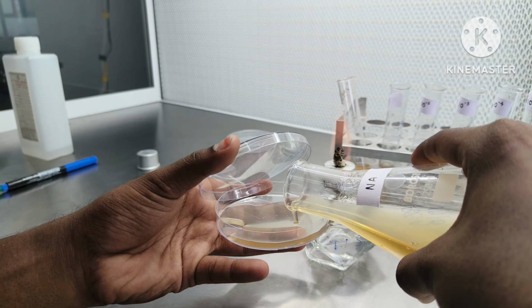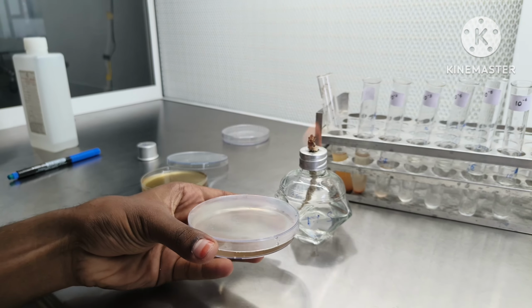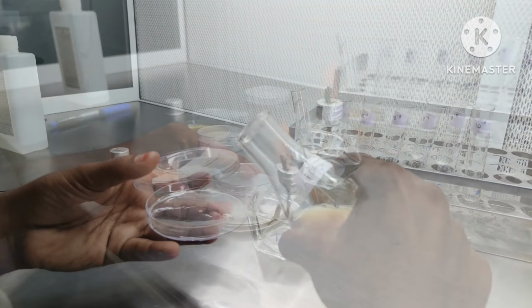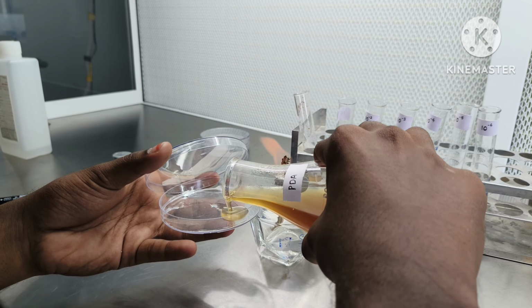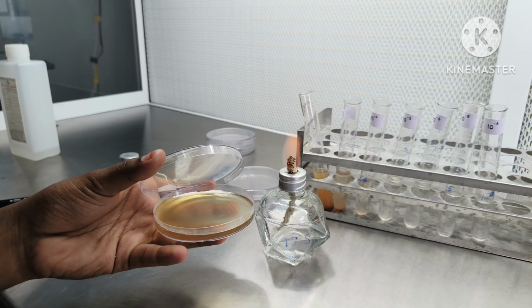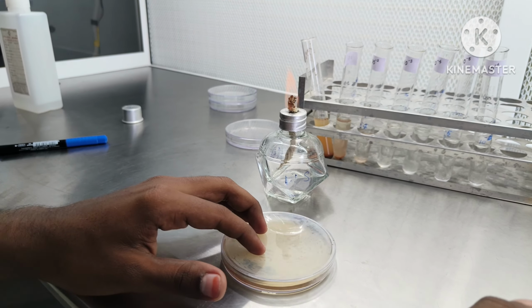15 ml of molten and cooled nutrient agar medium was poured to a disposable sterile Petri plate. The plates were then rotated in clockwise and anti-clockwise direction for the uniform distribution of media. 15 ml of molten and cooled potato dextrose agar medium was poured to a disposable sterile Petri plate. The plates were then rotated in the same manner done earlier.